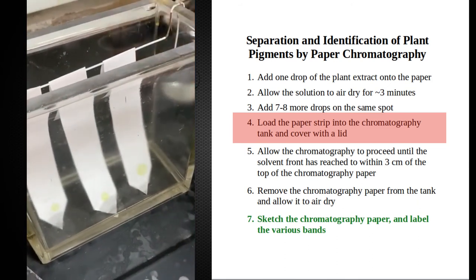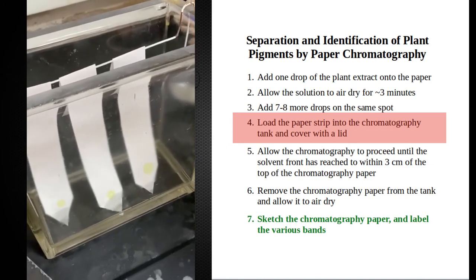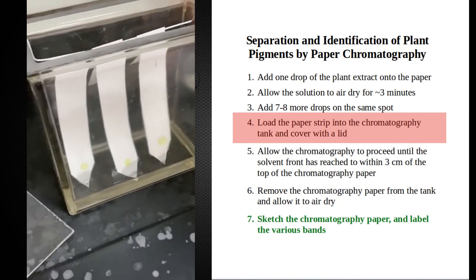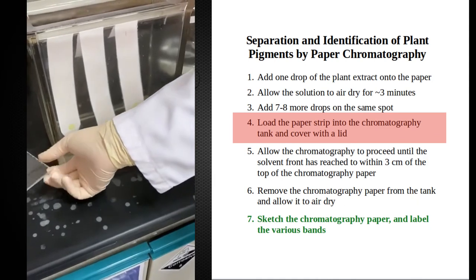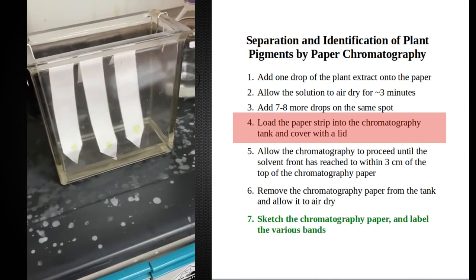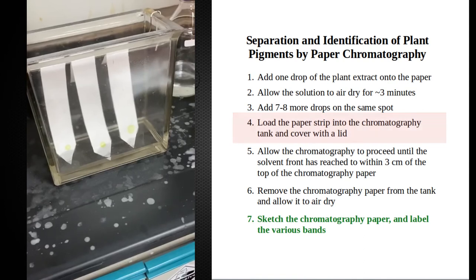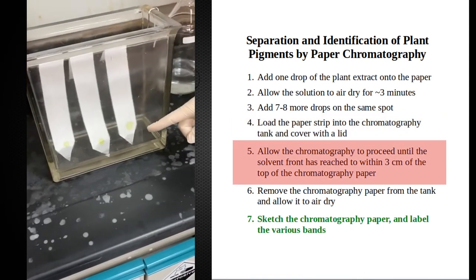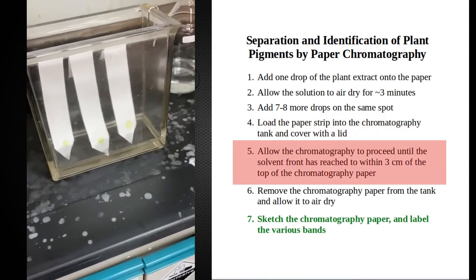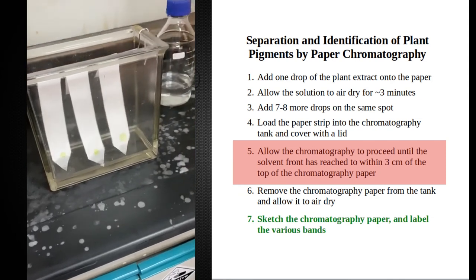Now as you can see, the solvent is traveling. I'm working under the hood because the petroleum ether and acetone are volatile. They should not be allowed to evaporate inside the room. We will leave them to migrate and then we will see the separation of the different pigments of the chlorophyll extract.